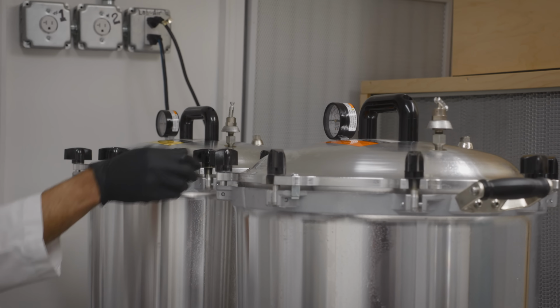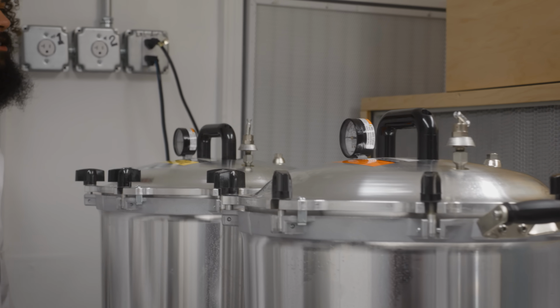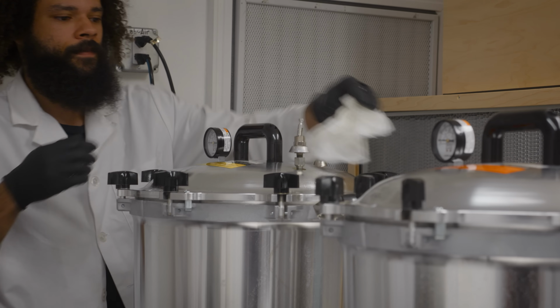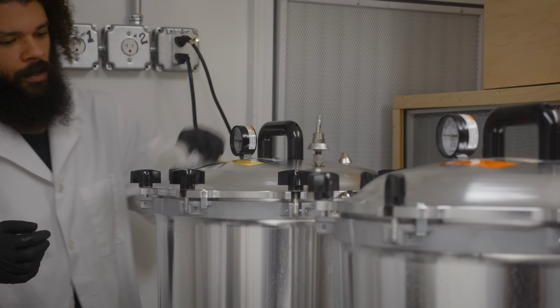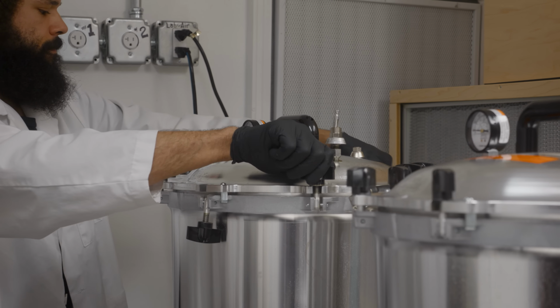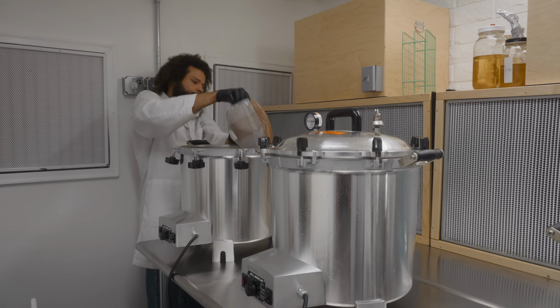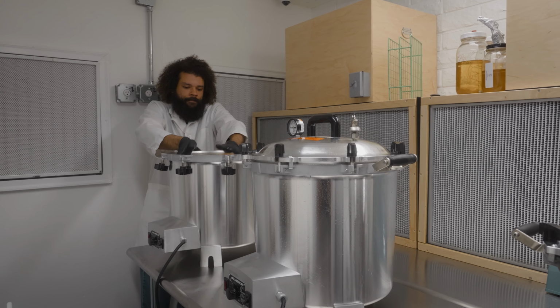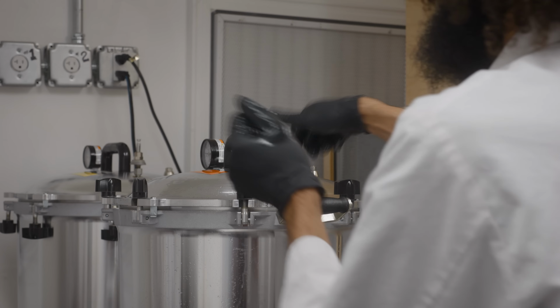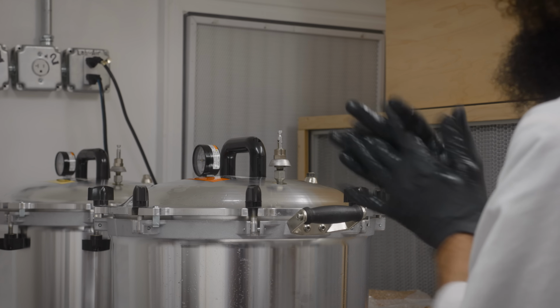So I'll go ahead and vent out the pressure. I'll just do it one at a time for now. Then as soon as the pressure is released, we can just go ahead and open up the lid. And just do the same thing over here.